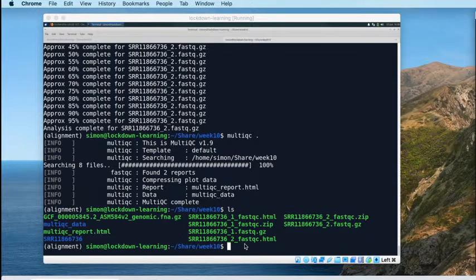The first step of which was to use this Burrows-Wheeler transform to index our genome to produce what is termed by the Bowtie authors as an FM index of our genome. And to do that, we need to index our genomic DNA FastA file that we downloaded from the NCBI, this file here.